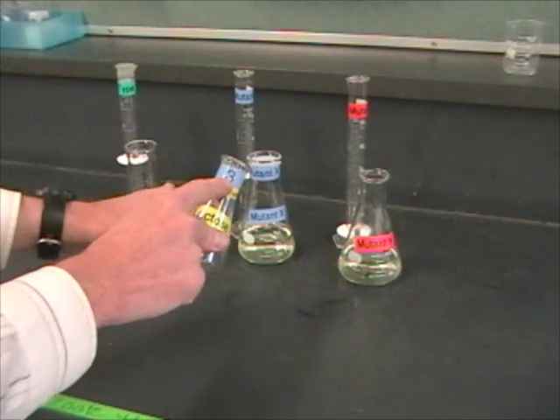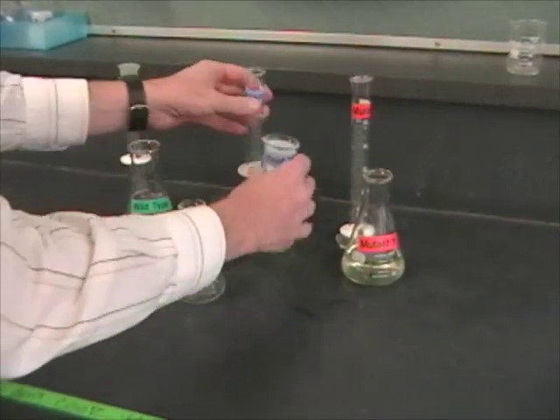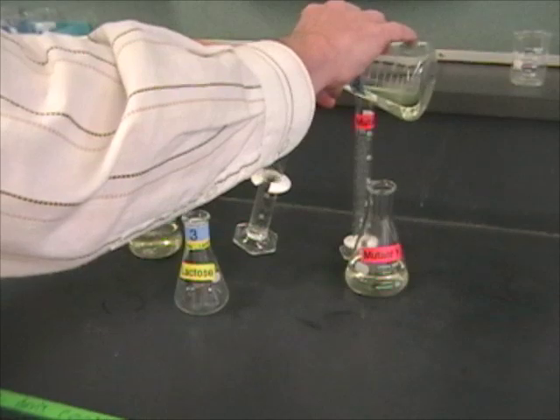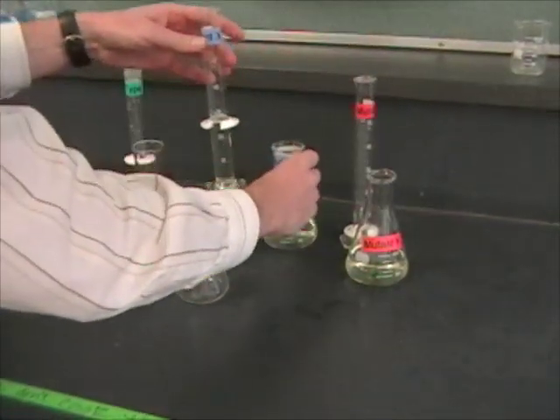Now, I have sample number three for my table, and that means that I'm going to need mutant X. And so I'm going to measure out 27 milliliters of mutant X, and then take this back to my table.